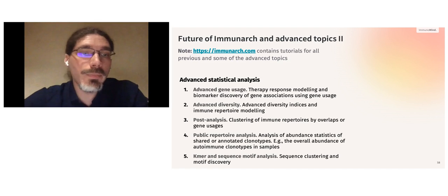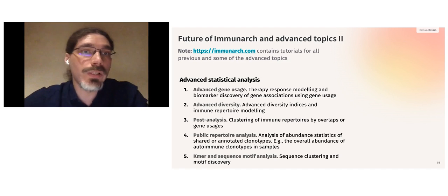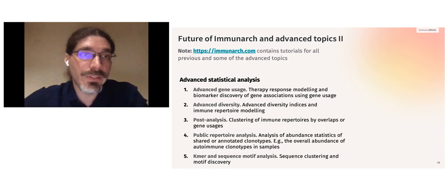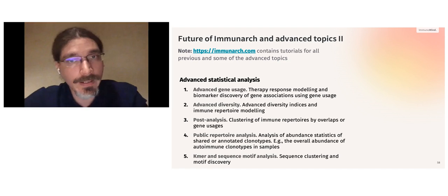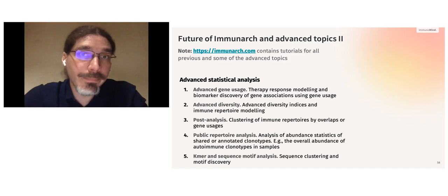So we are a little bit hesitant to implement or to integrate any of the methods because we would like to wait and see whether it is possible to provide the quality of analysis we strive for, or is it too risky. But again, if you have any suggestions or ideas, please feel free to message me.